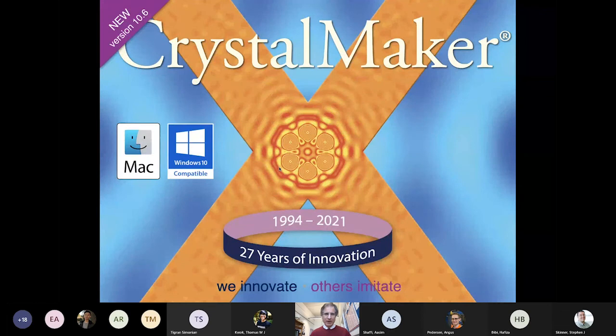So the first package we're going to talk about is CrystalMaker, which is our visualization package. And this has been around now since 1994 or the end of 1994. And in fact, our first customer was a materials student in Cambridge, and we developed the software from there.